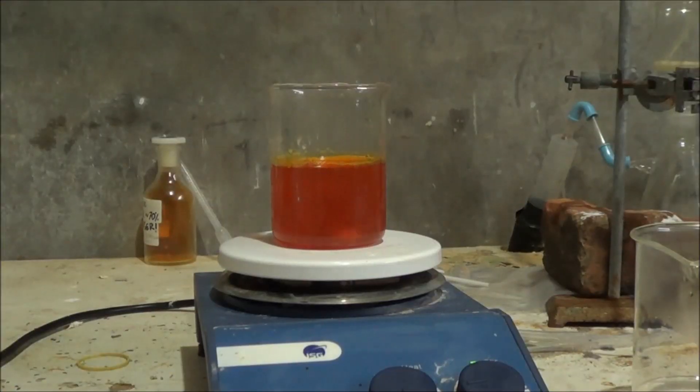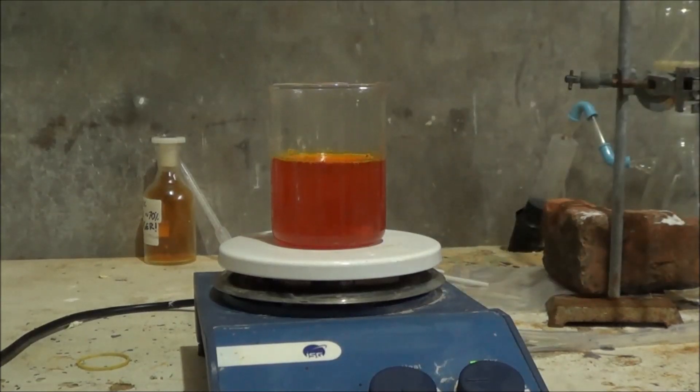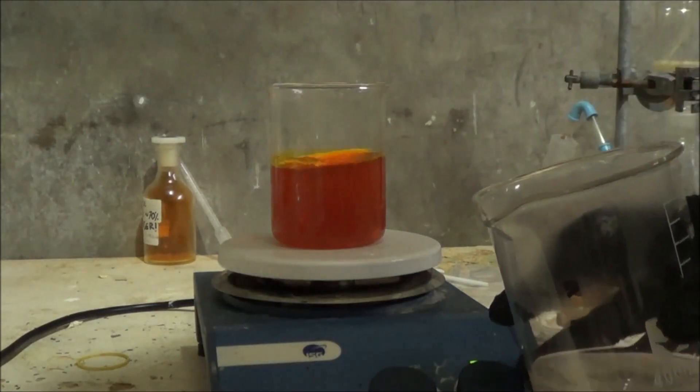Still can't decide if I like that extra light in there or not, but what we're going to do now is we're going to add some ammonium sulfate, and that'll precipitate our calcium sulfate and leave us behind ammonium dichromate, which is exactly what we want.